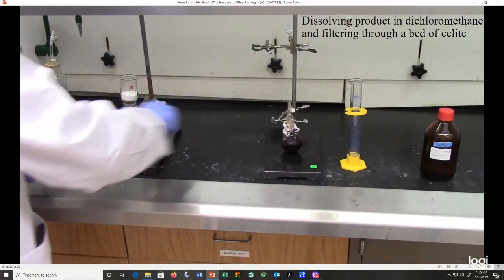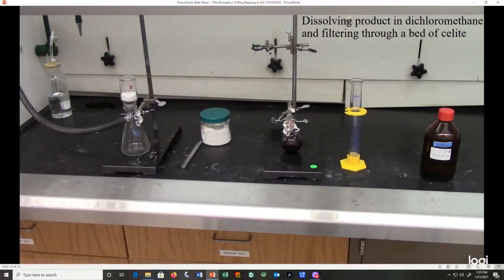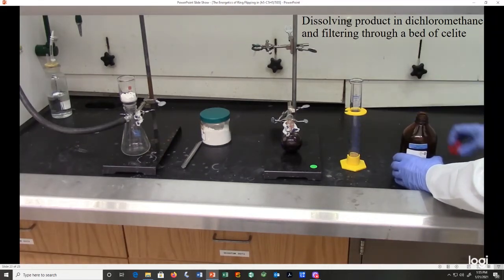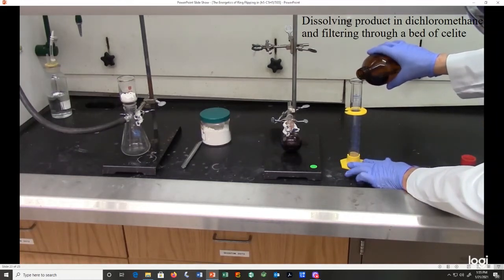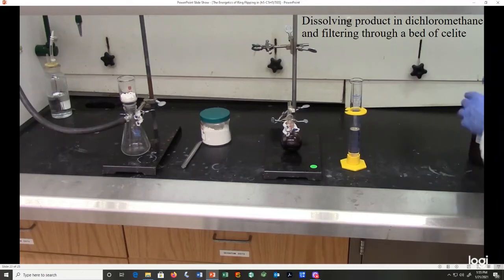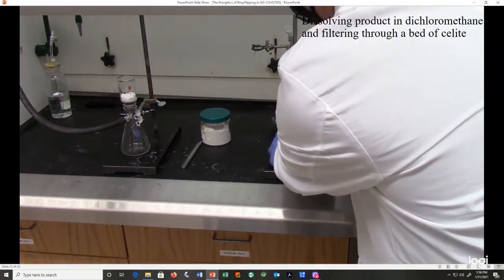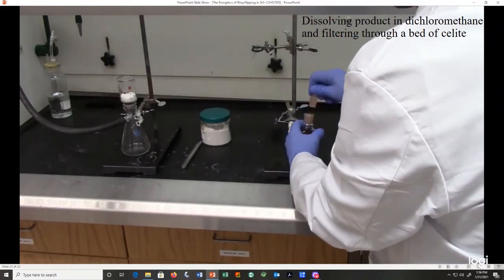So we're just going to put about a half inch of Celite in our filter, turn on the vacuum. We're going to get about 50 milliliters of dichloromethane. We're going to redissolve our product.